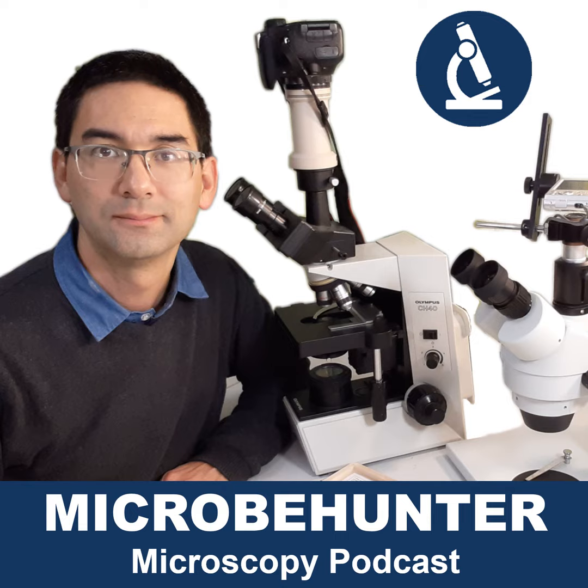So what does this all mean now for the amateur? If you want to get a microscope from one of the four big microscope manufacturers, Olympus, Nikon, Zeiss or Leica, then essentially you are almost bound to go for infinity systems. These manufacturers have switched over, and they're now producing infinity systems.